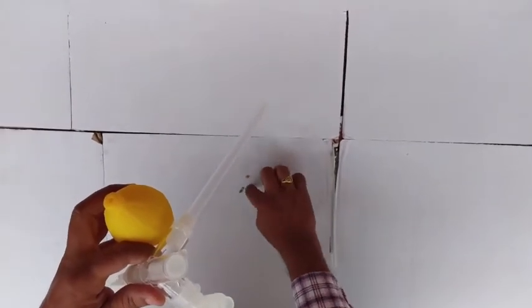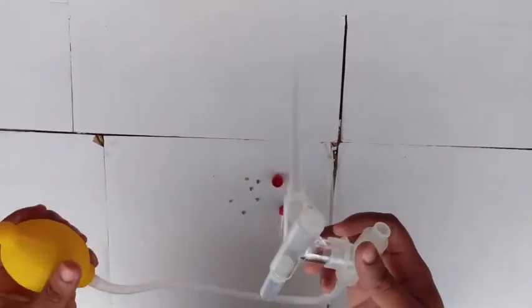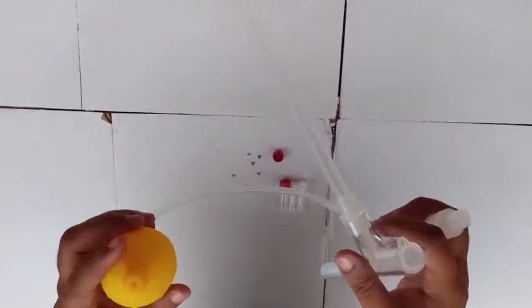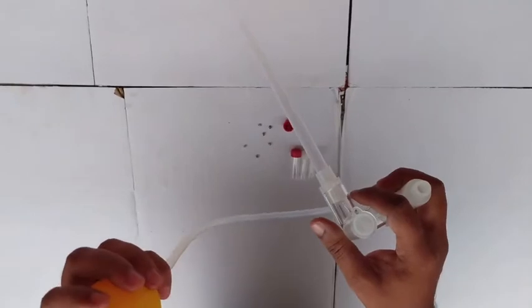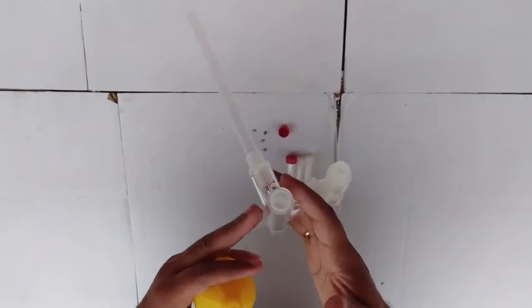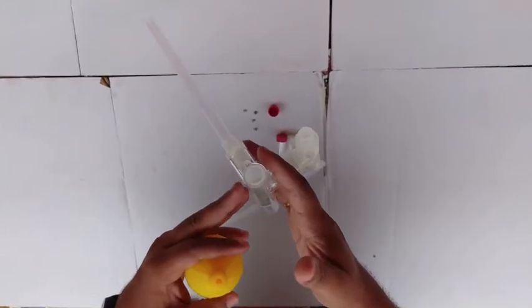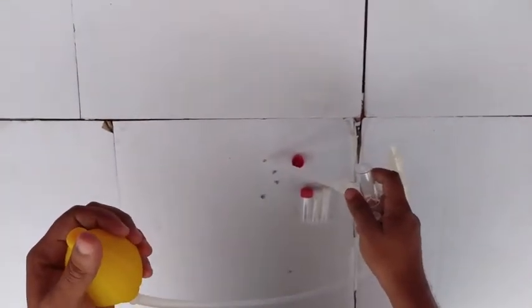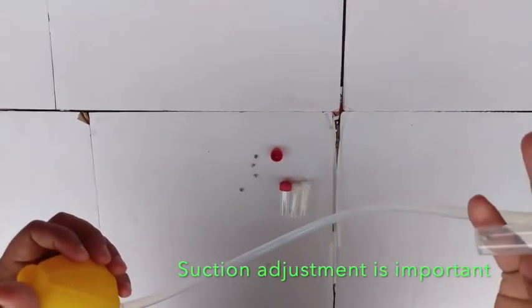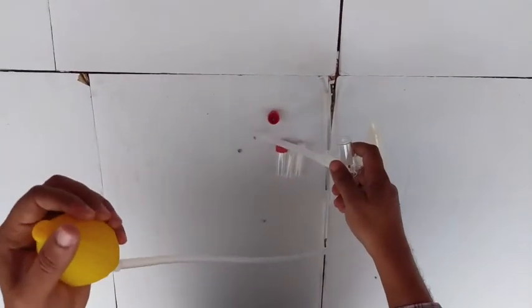I'll demonstrate using paper rolls as mock insects. You need to hold this part in your right hand and keep the bulb in your left hand. Always hold the bulb in the upright position for easy collection. Now point the tip — just imagine this is an insect — point at it and press to suck it in. You can see the insect is now in the collection vial.